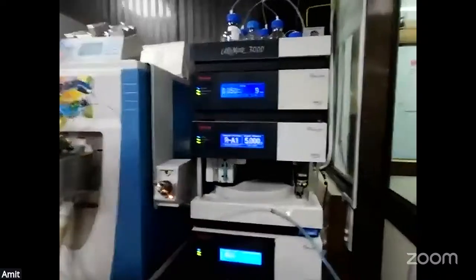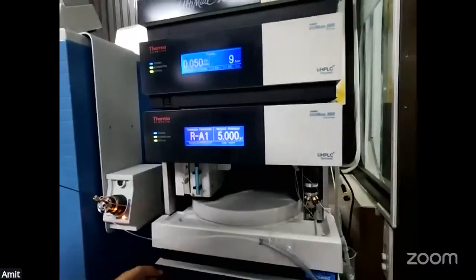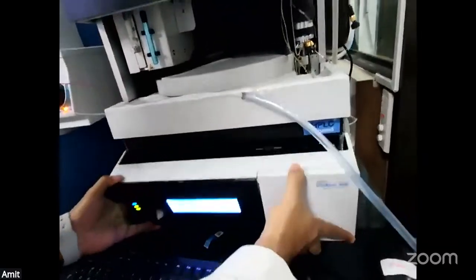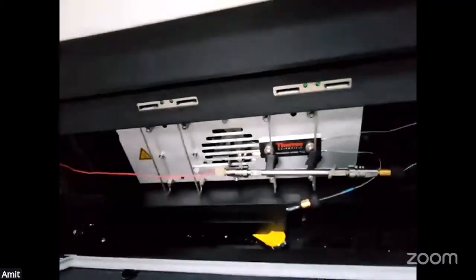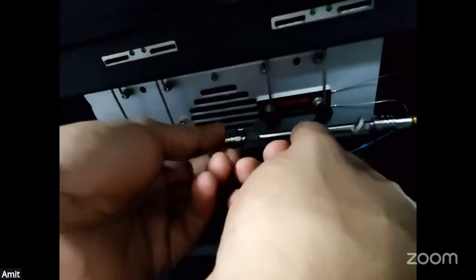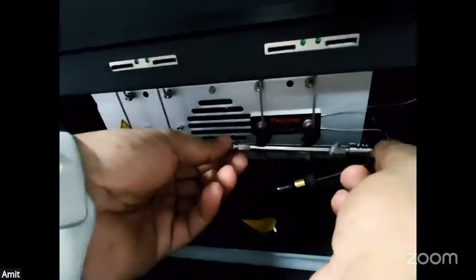Now, if I show you the HPLC system, this is the system here, and in this particular area, different columns are situated. In case of lipidomics samples, the C18 column is used. In the different modes, we need to switch between the columns. So you can see the column here.